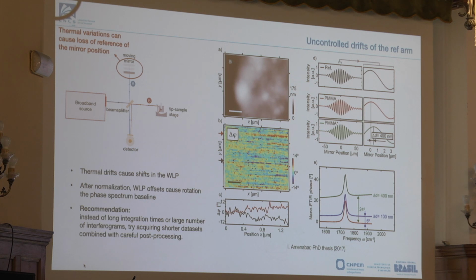One thing to do is to avoid very long experiments. Then you can control this more. You take, let's say, several quick experiments, quick spectra, and you can add those in the end, knowing what's happening with each one. This could be something to do.